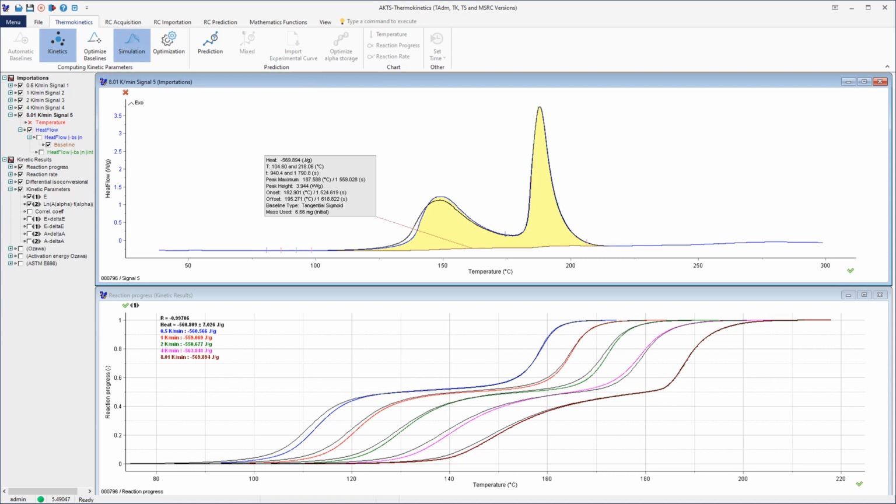The thermoanalytical peak, for example, the signal of a heat flow rate as in the case of DSC, is placed between the points of departure from, left limit, and return to the baseline, right limit. The proper choice of these points significantly depends on the thermoanalytical device's sensitivity and the measured signal's shape.